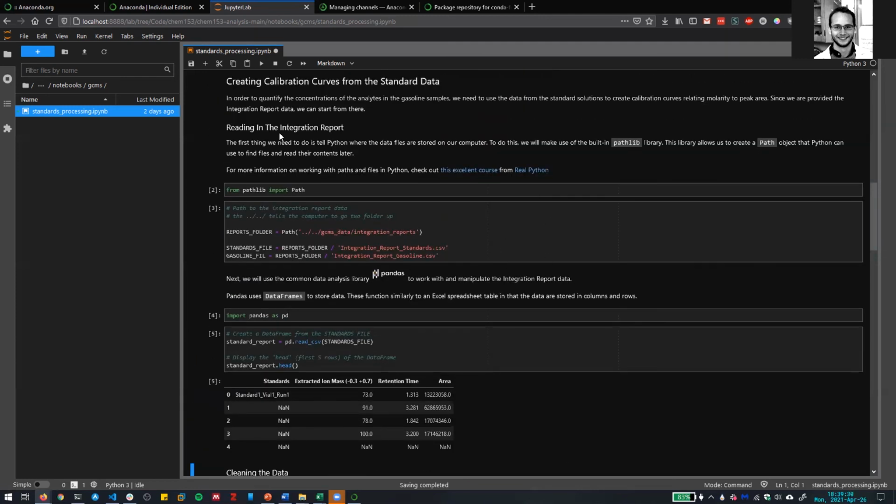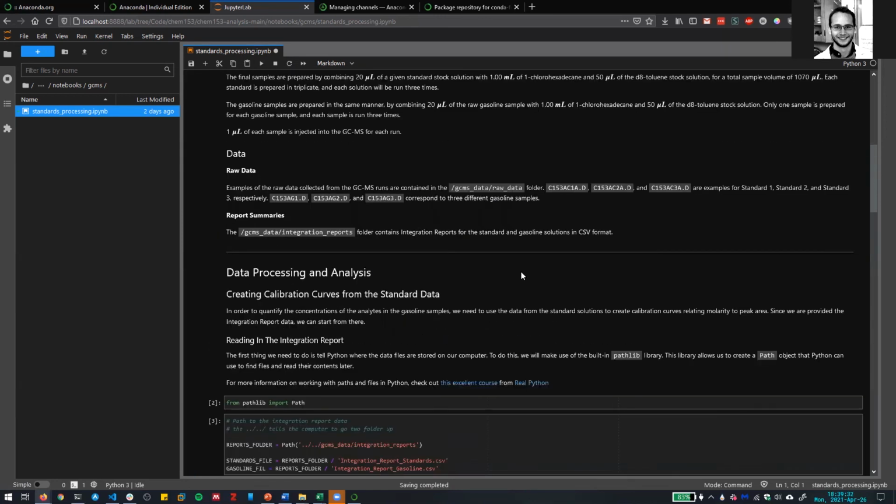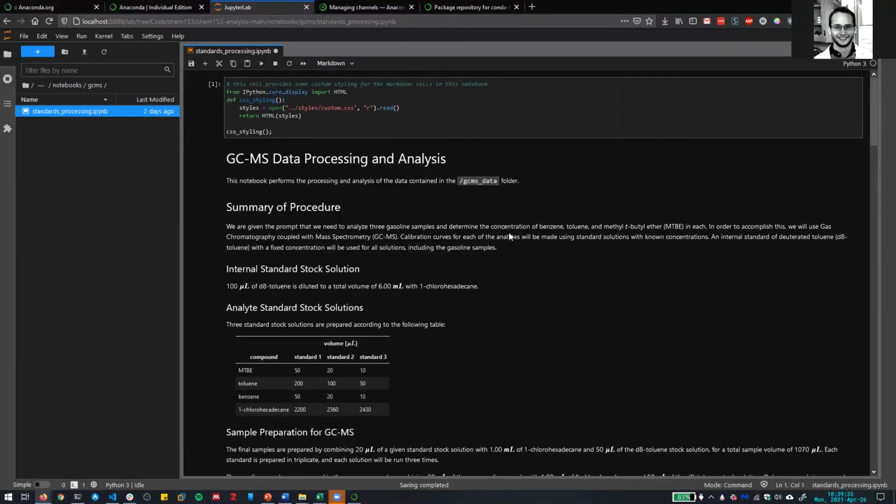So thumbs up from people who have opened this IPython notebook and have been able to run at least this first cell. Okay, well, I know Richard has, but nobody else is quite there yet. Are we stuck on getting the zip file extracted in this same directory? No, I'm about to open Jupyter. Okay. So I'm barely going to get to that point. Okay, no worries.